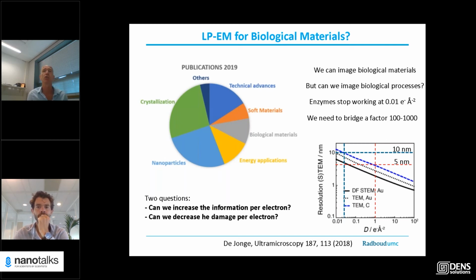Now, of course, small molecules are not active and are not relying on enzymatic action, but we need to assemble them to a certain size before we start seeing the aggregates they are forming. So in my view, yes, it is certainly possible, but we still need a couple of steps to be made in the methodology that we are developing. Thank you, Nico.